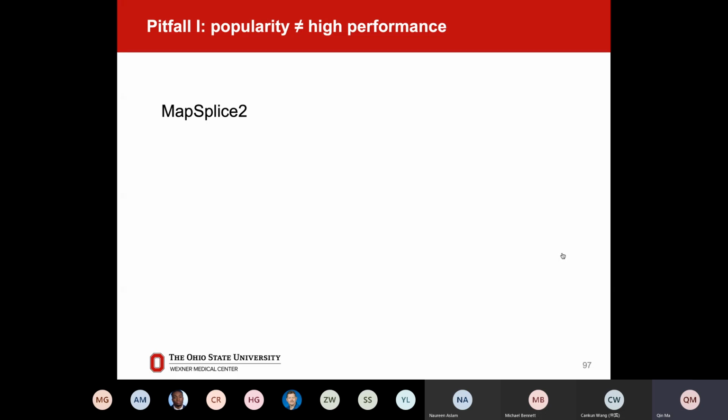I do believe some of you should have experience in analyzing reads alignment. So please just let me know, by saying yes, when you see a name which is familiar to you in my next slide. The first tool is MapSplice. Anybody heard about that or used it? Okay, next one, CRAC, GSNAP, NovoAlign. No. So TopHat. Has anybody heard about TopHat?